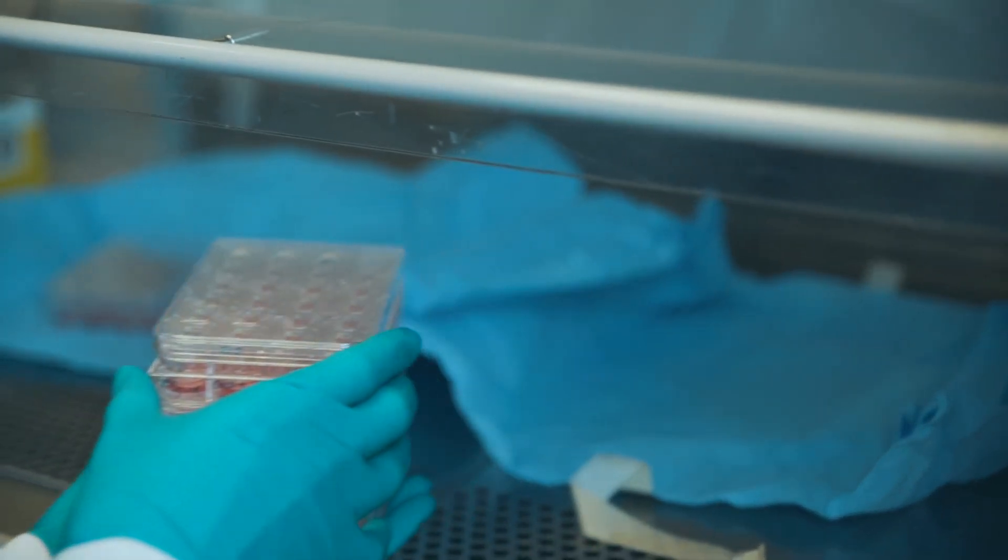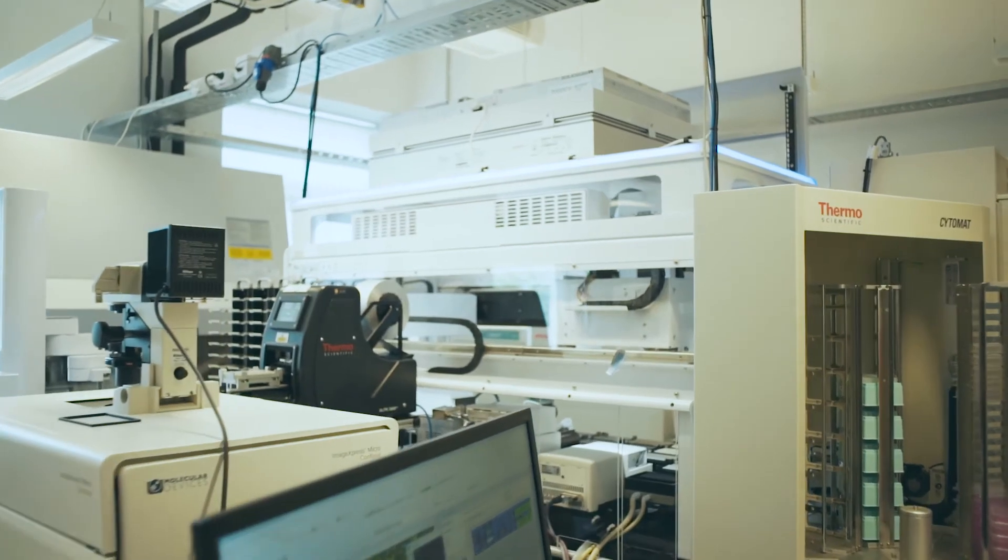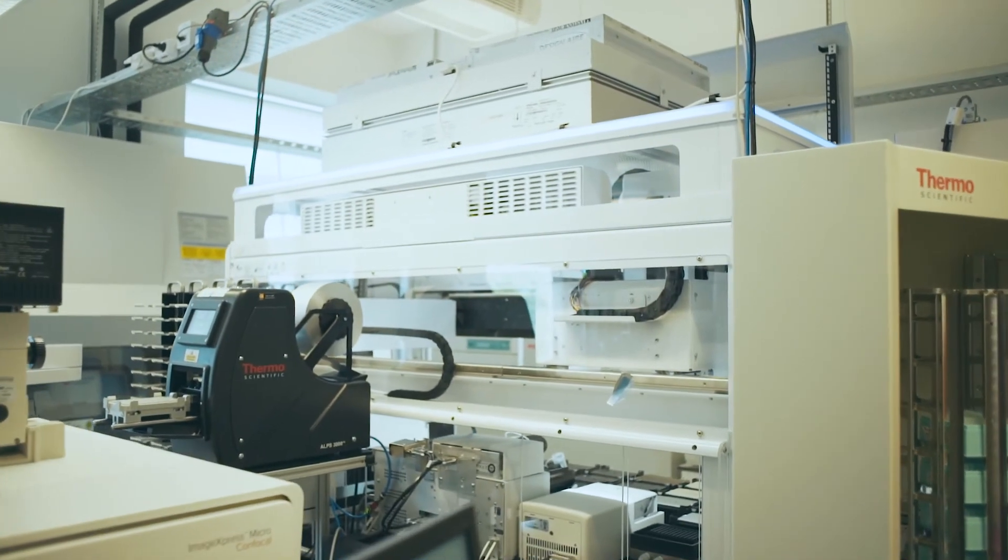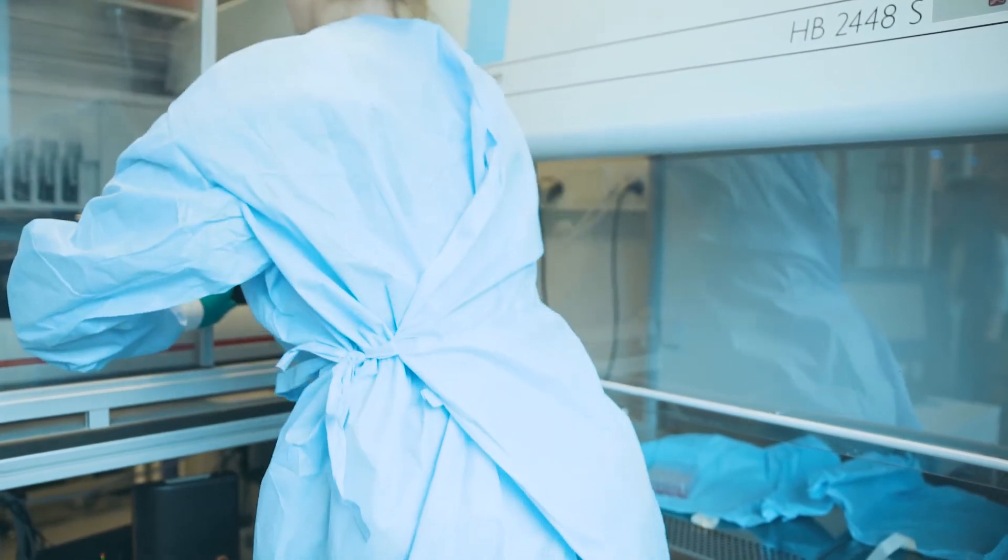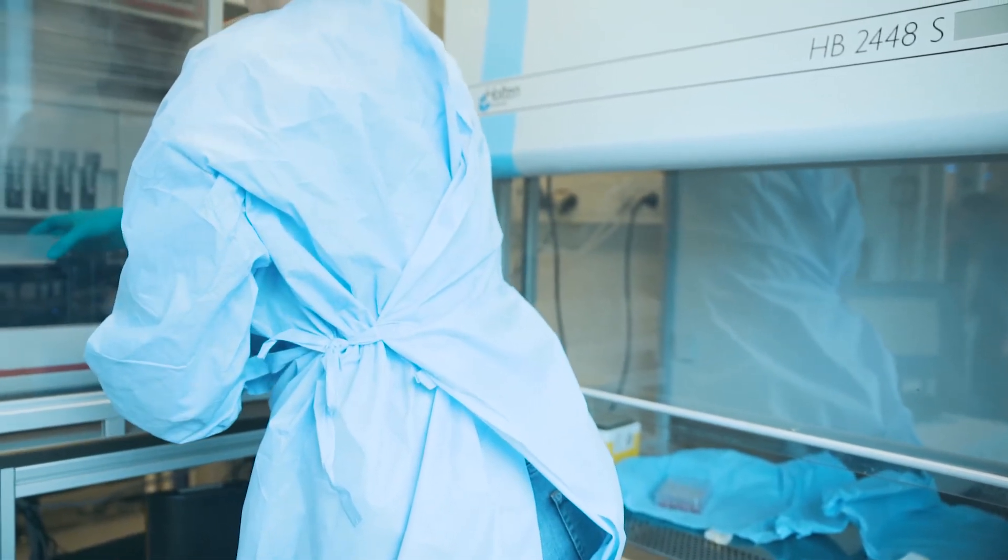The Biomech's inbuilt enclosure with HEPA filters reduces contamination risk by providing environmental control. Sterile enclosures provide additional protection from contamination.